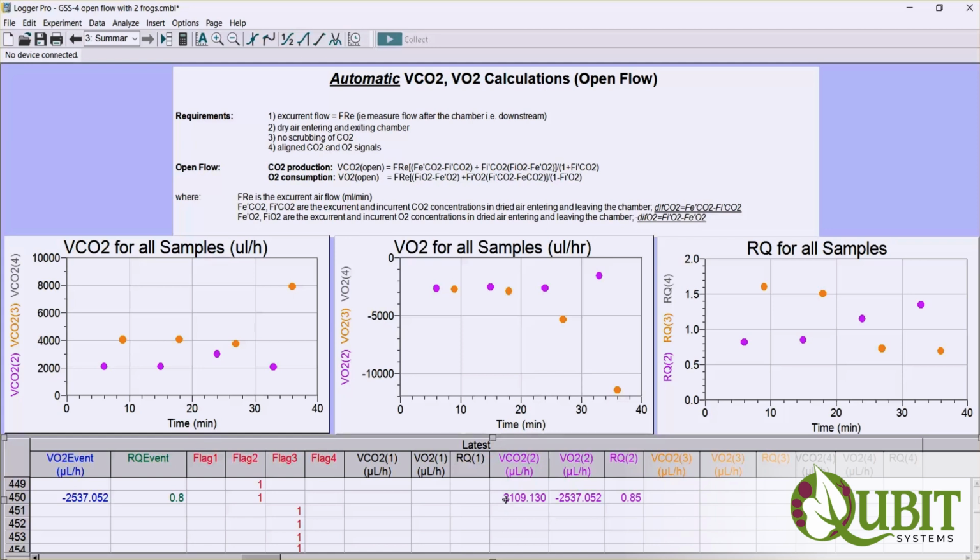Here you can see data points for channel 2, and you just have to scroll up and down to find the appropriate time points when this data is calculated. Oh, I just passed channel 3. As I said earlier, the software calculates a single point for each dwell time, and those are the points that are being graphed here and shown in the table.